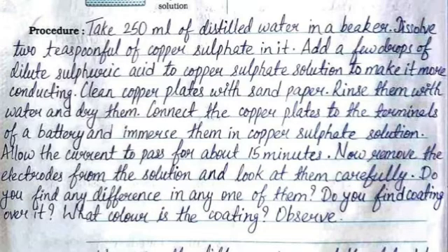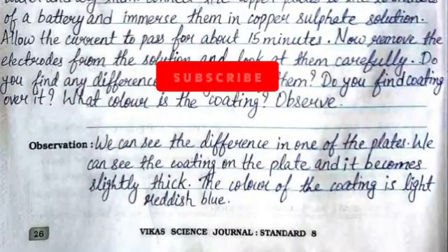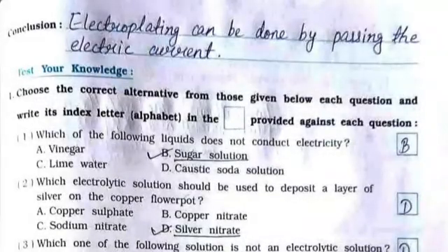What color is the coating? Observe. The observation is: we can see the difference in one of the plates — we can see the coating on the plate and it becomes slightly thick. The color of the coating is light reddish blue. The conclusion is: electroplating can be done by passing electric current.